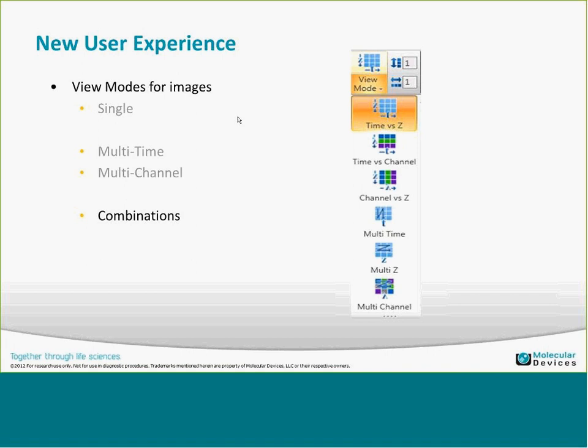The scripting feature allows you to create an automated process through IronPython using the script dialog within the application. You get context help — as you type a method, variable, or function, it shows up in a list so you can automatically select it to fill in the text. You can also copy text from an external editor.